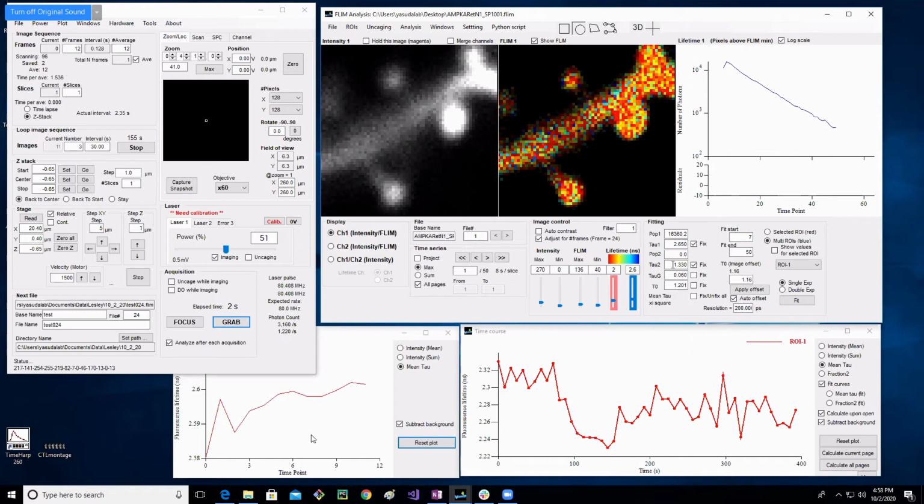We normally estimate it, again, in a situation where your sensor is undergoing high amounts of FRET, using a double exponential fit and estimating what tau 2 is. Once we have a good estimate of it, we usually fix it. The good thing is that the actual number that you put in here for tau 2 really doesn't affect your data hardly at all. Like if I put in 1 or 1.3, it really changes almost nothing in the data. I've actually tried this, so I feel confident in saying that. Okay, so once we have those two values fixed, for most sensors, you'll fix those values throughout the whole experiment, okay?